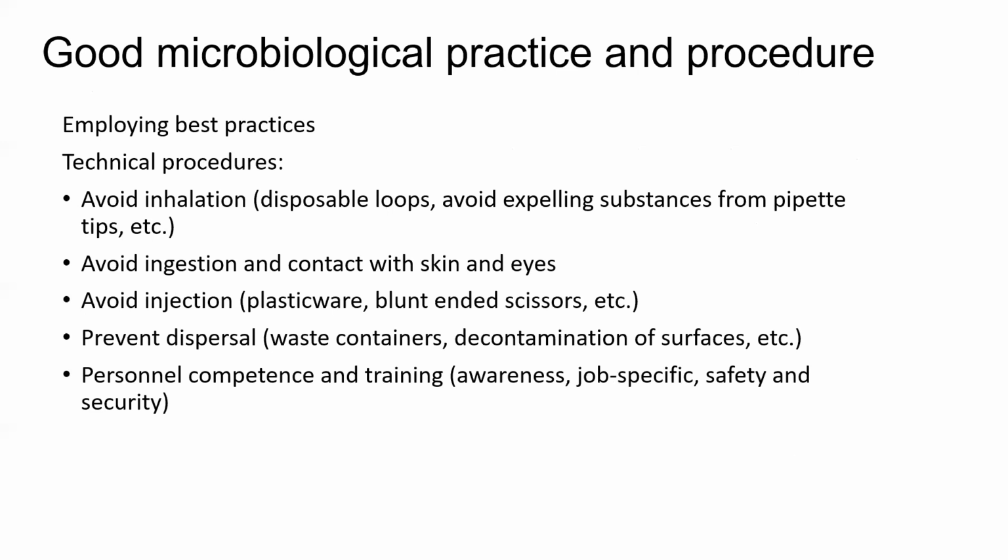And one important thing I've touched on, GMPP. I want to say that this is kind of the foundation of laboratory work and ensuring that staff are doing the appropriate thing. It goes a very long way in preventing incidents or exposures. Employing best practices, technical procedures that allow one to avoid inhalation.